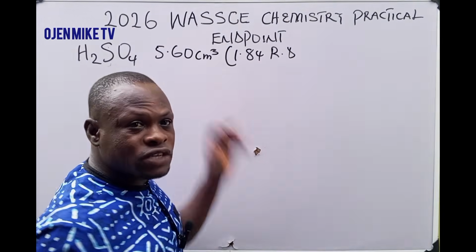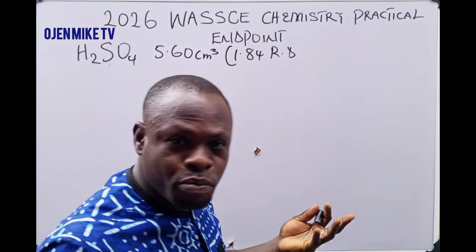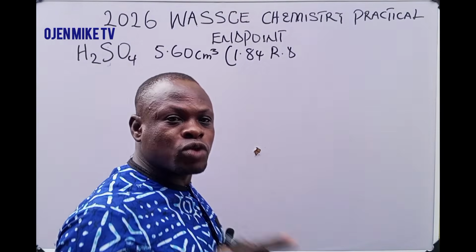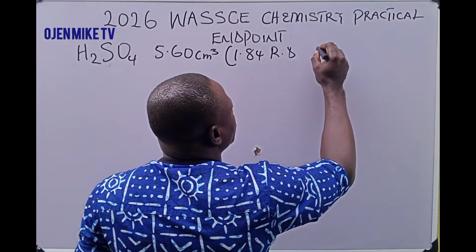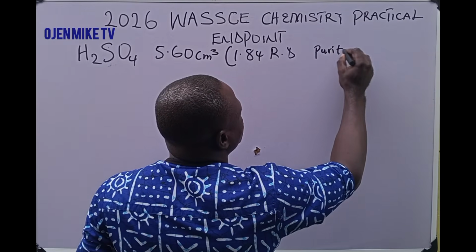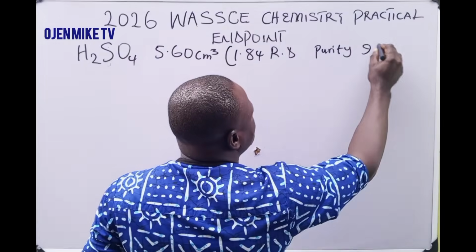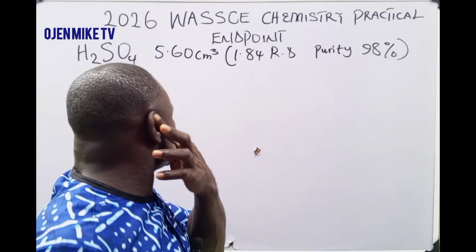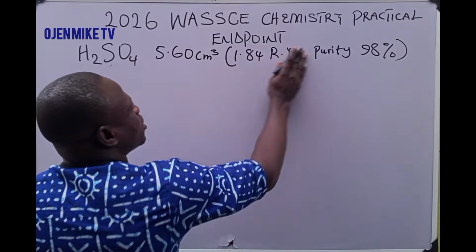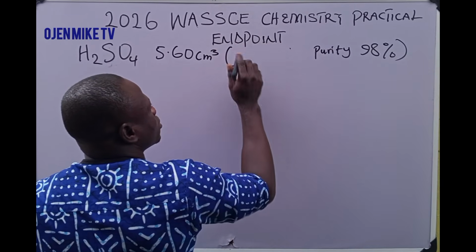And the purity of this acid, remember, it is not 100% pure, which is one of the questions they are going to ask. The purity is 98% pure.